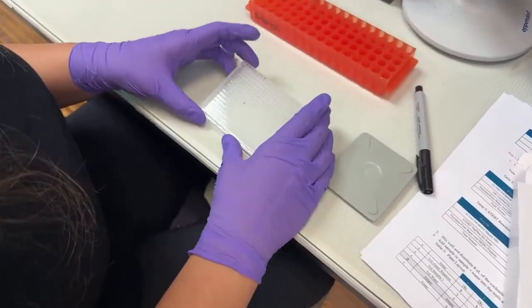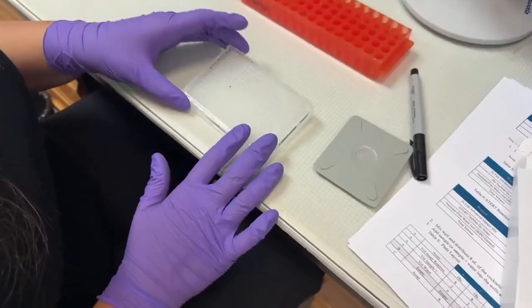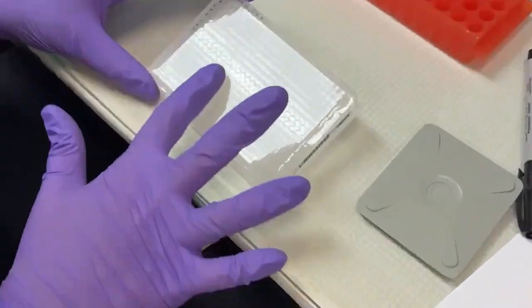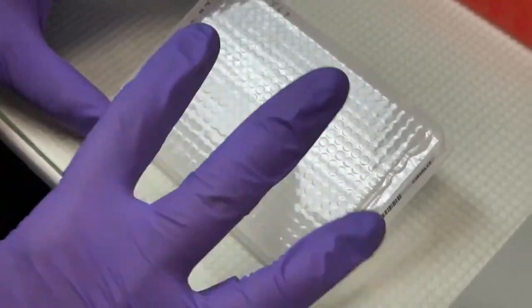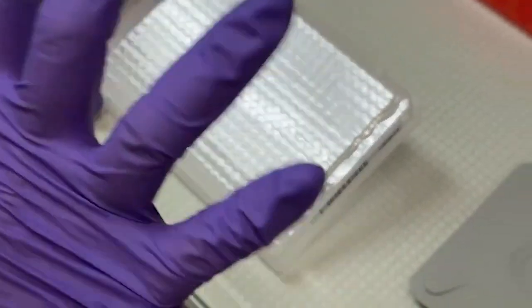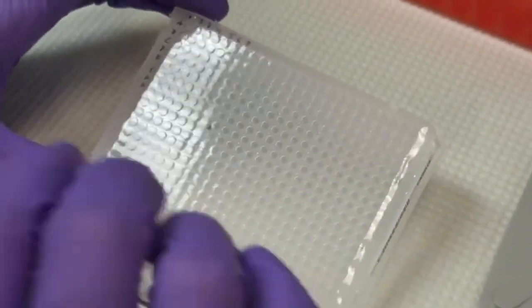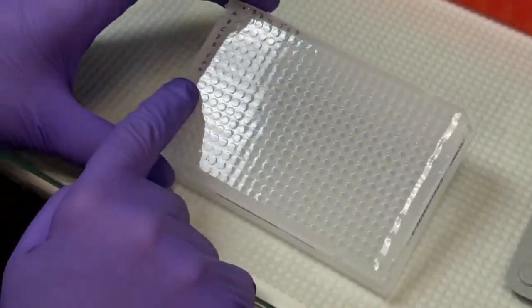You're going to have a really hard time seeing this on camera, but often what you can see is if there's an incomplete seal, you'll actually see a difference in color. So it almost looks, the reflection is different. So if it's not stuck, it'll actually look like a white spot rather than a nice dark circle.